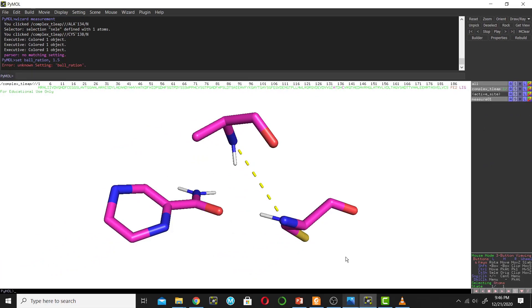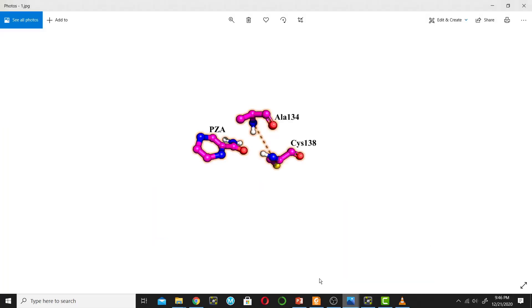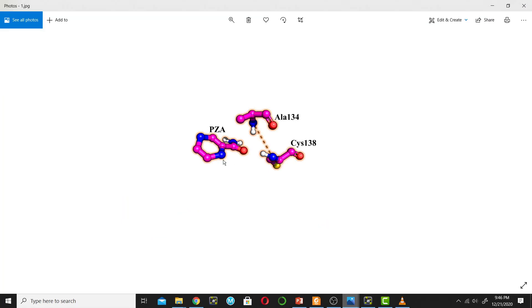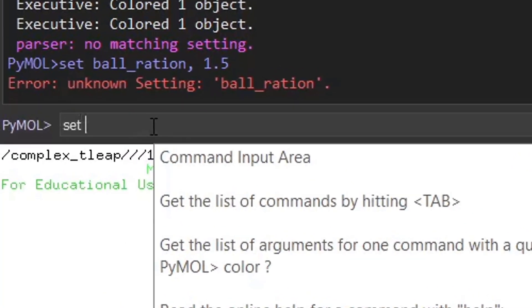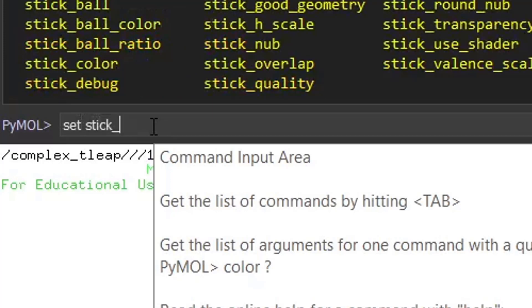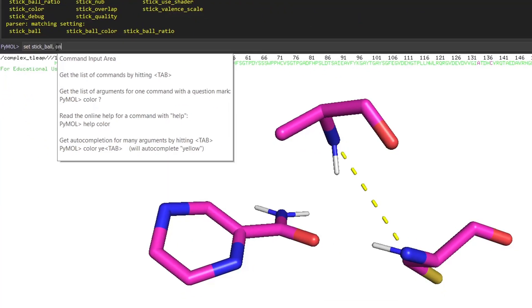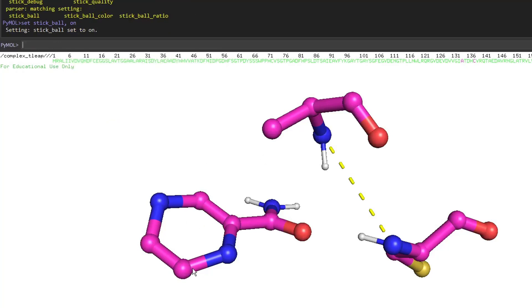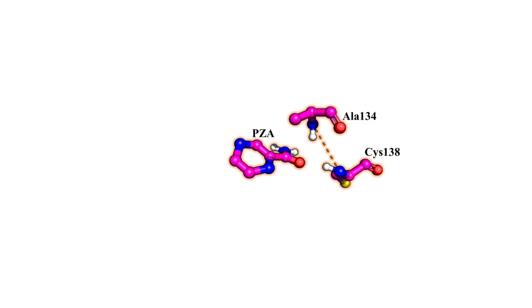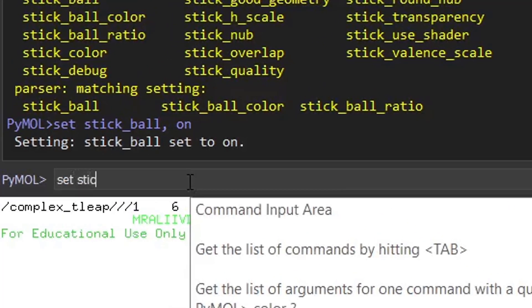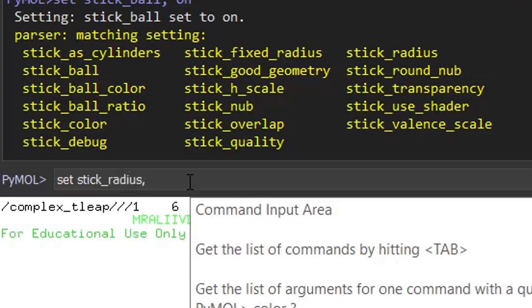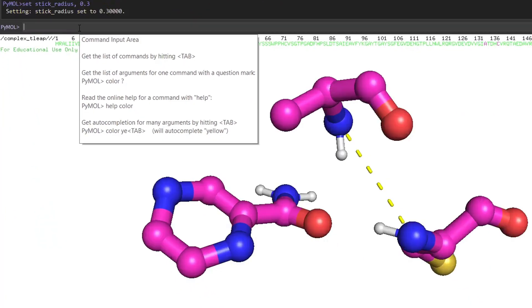Now we have a picture, but we will do some editing to make it more beautiful. If you check the reference picture, there are balls on each corner of the sticks. We will do this using command line in PyMOL. Type the command: set stick_ball, on. Now we have balls on each corner, but the stick radius is a bit thin compared to the reference, so type: set stick_radius, 0.3.